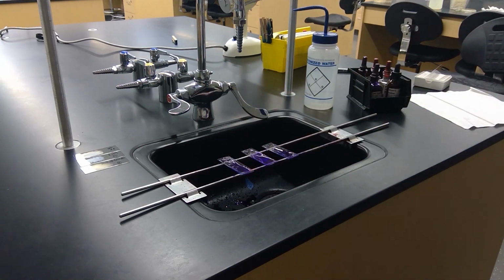Alright, now we're at step 6. Carefully add gram's iodine to cover the smear and let that stand for 1 minute.